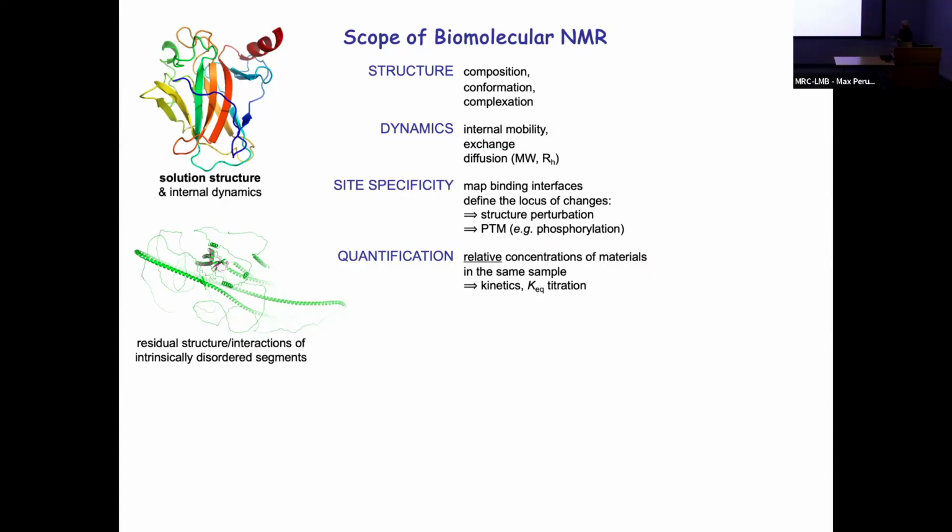So the advent of AlphaFold has had a huge impact on NMR because it enables us to generate candidate structures that we can then validate. So we still have a role: from the AlphaFold structure, can we validate which of the proposed conformations are present in solution? And that's one of the roles that we fulfill.